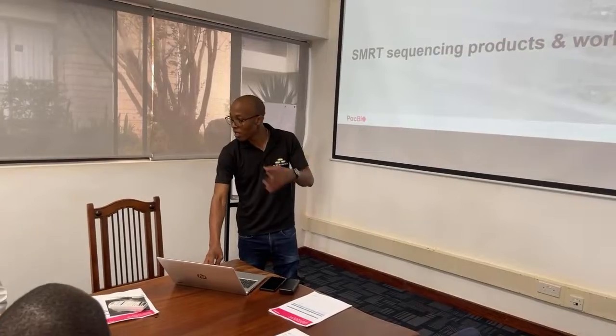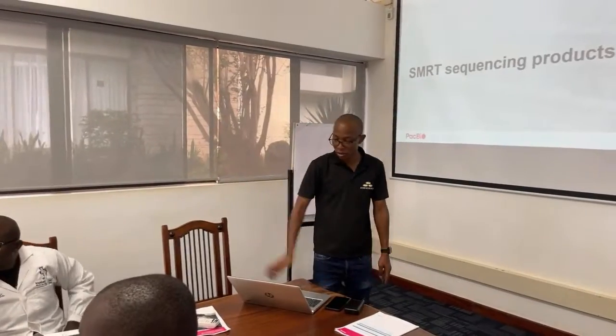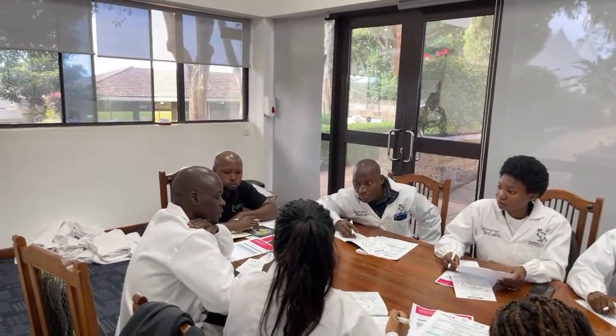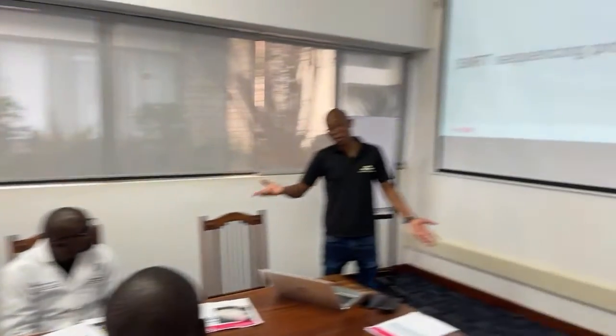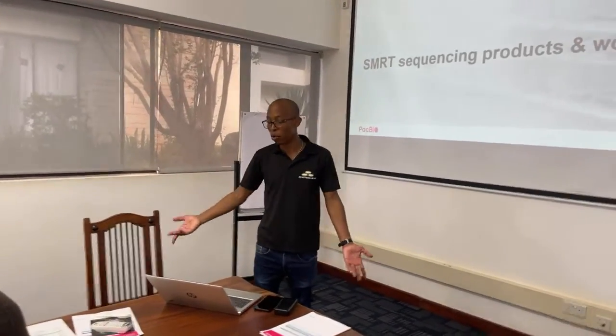I'm not sure if it's been sequenced, but if it hasn't been sequenced, that's even great. It hasn't been sequenced. Yes, perfect. Because that's what we want to do as Africa BP. We don't want to replicate the stuff that has been sequenced before, right? But the genome size is between 500 MB to 800. Yeah, the relatives are ranging between that. There's one that was being sequenced in Japan. Okay, if it's like that, it's even better because that means we don't need many SMRT Cells. We can do it with just one SMRT Cell or two.